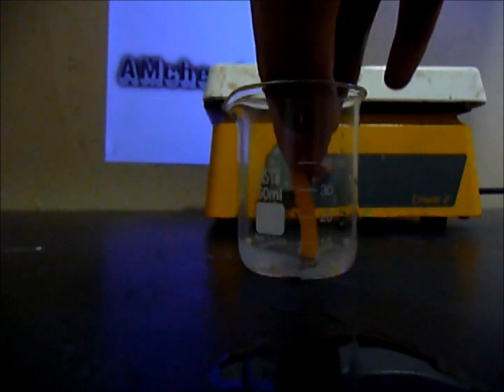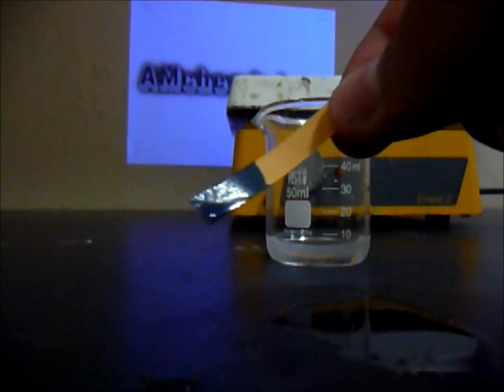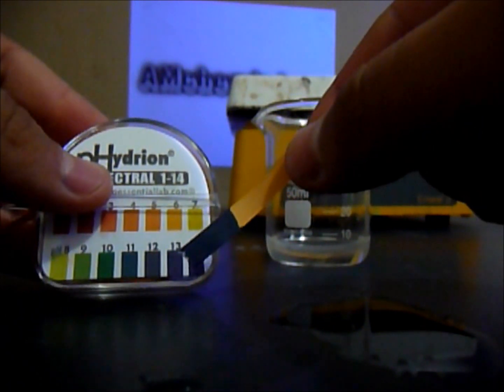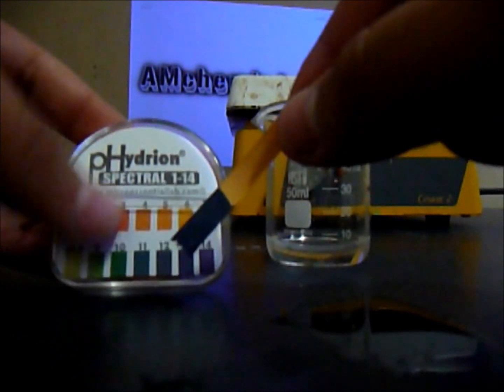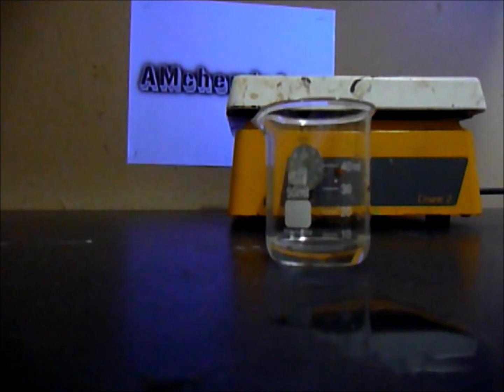Now that the sodium carbonate is in solution, just simply put a piece of pH paper. And you can see that it turned dark, which is around the high base area. So this is how you make sodium carbonate, just by heating sodium bicarbonate.